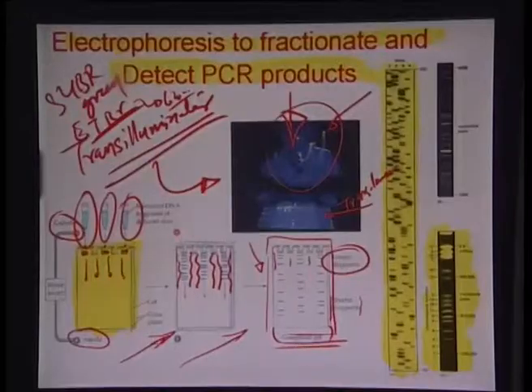Now we have been talking about this off and on, that the Human Genome Project necessitated great rapidity or tools which could be more sensitive and rapid, and with which much more minuscule samples could be successfully interpreted. Therefore people started thinking about what would happen if you could introduce this surface area to volume ratio concept in electrophoresis as well. Some of the most prominent research work developed with this concept in mind is what is known as capillary electrophoresis.